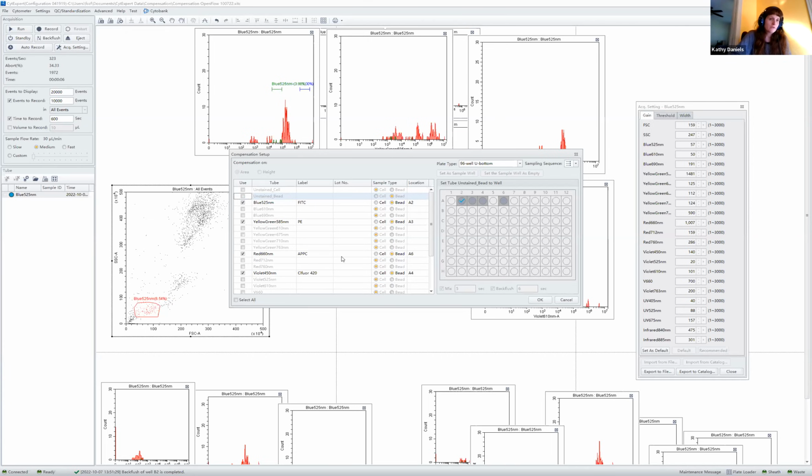And that is something that can happen. So theoretically, when you're initially doing your setup, you can choose unstained bead instead of your fully stained, and you have to choose another fluorescent detector. But that gets a little bit more complicated. So we're going to skip that for a little bit later, if anyone has any questions on me going through that process.